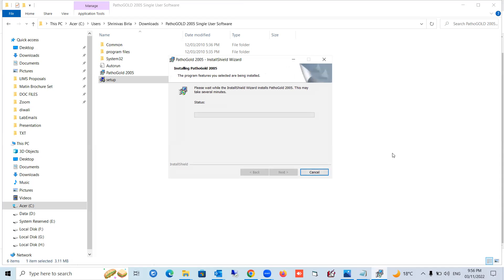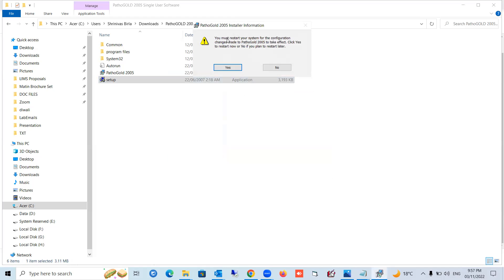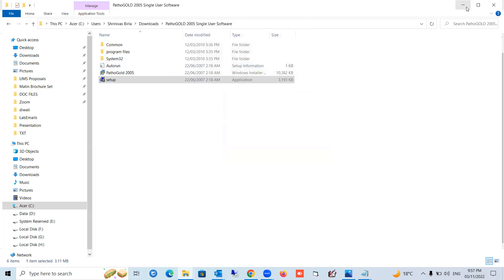Press Finish. Within a few seconds it will install — installation is very fast, depending on your computer speed. Once installation is completed, it will tell you to reboot your system. Press the Finish button and say yes to restart. After restarting, the software icon will appear on your desktop.